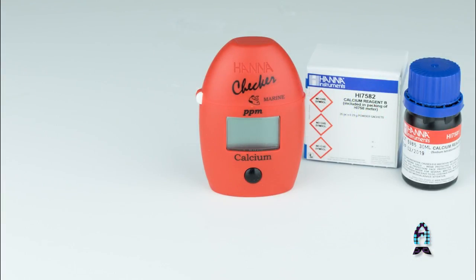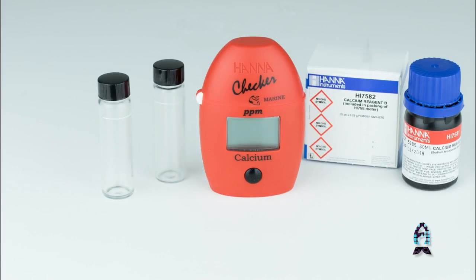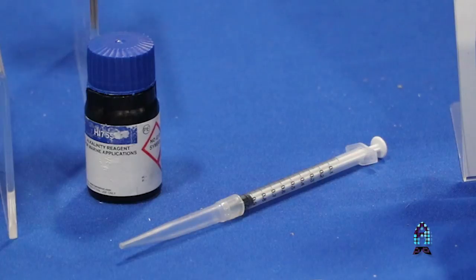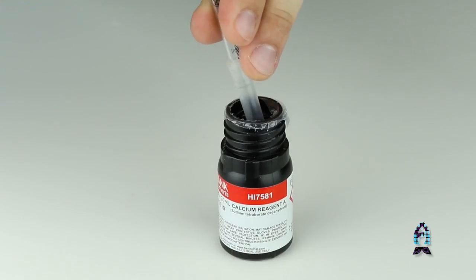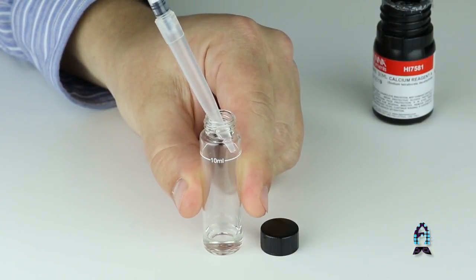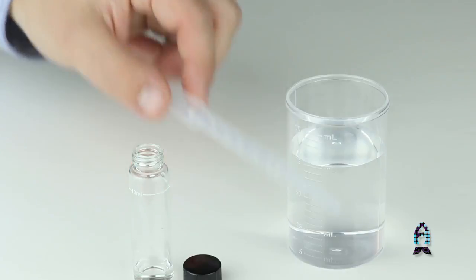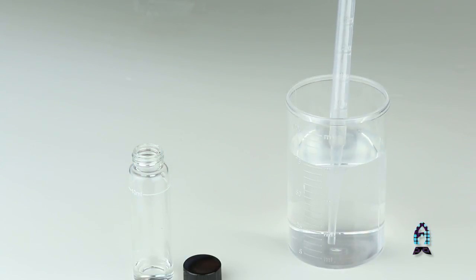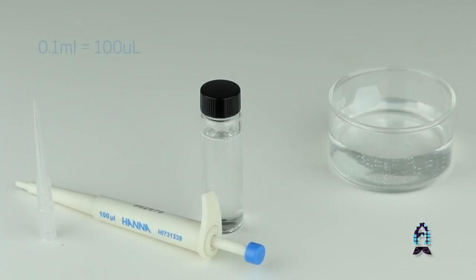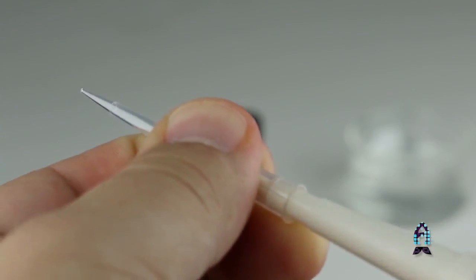Most people know our calcium checker — it's been in the industry for quite a while. Some love it, some didn't like it so much, but one thing we did to really improve the test was include this new mechanical pipette. It's a 100-microliter mechanical pipette. The new calcium checker uses a 100-to-1 dilution to analyze calcium, meaning you use 10 mils of reagent in RODI water and 0.1 mils of sample. We had a 1 mil syringe that required 0.1 mils of sample to administer, which led to a lot of inaccuracies. Now we've included this 100-microliter pipette that allows for a fixed dosage of that sample to the cuvette, so you're going to get no increased or decreased sample size.